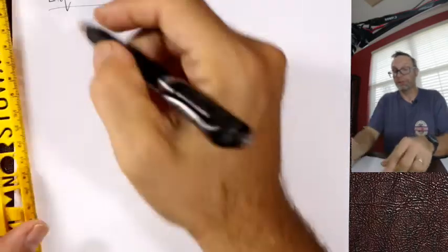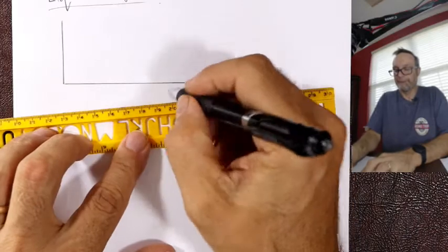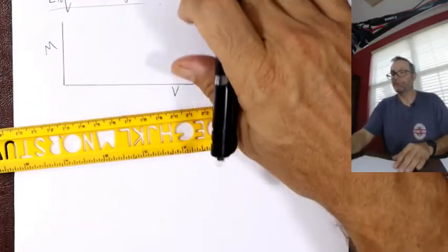And what you're going to do is plot a graph. There's the volume in milliliters, there's the mass in grams. Now if you think about it, move that down.